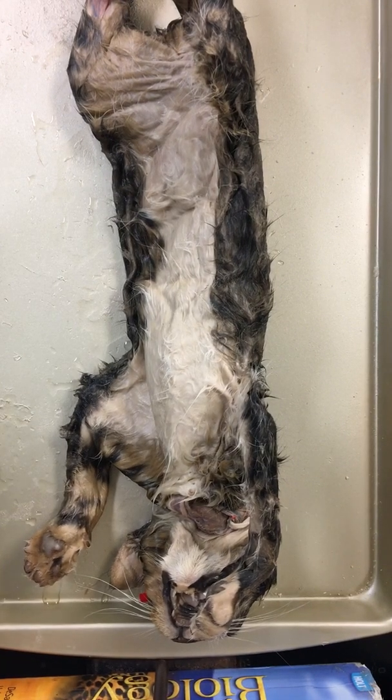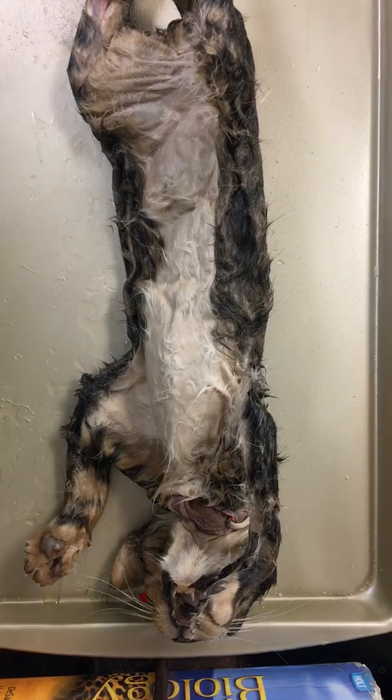Today is day one of cat dissection. We're going to prepare our cat by looking at the anatomical positions.